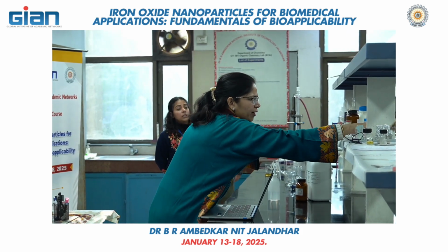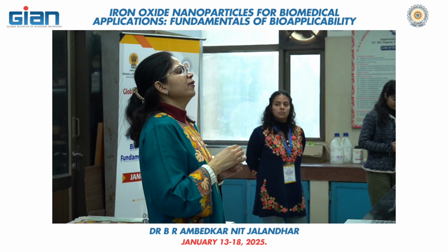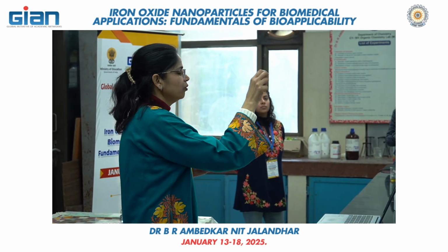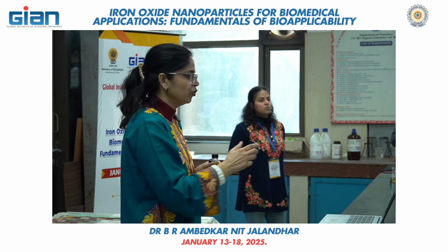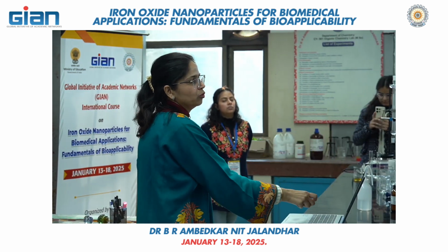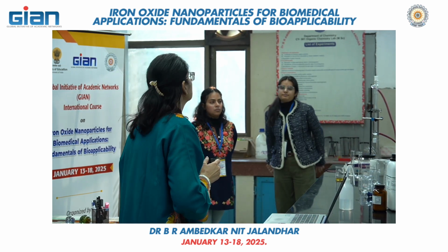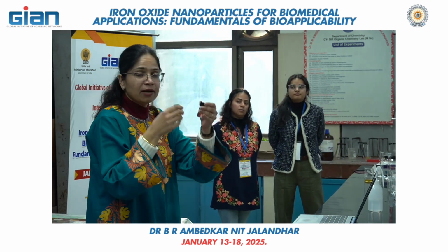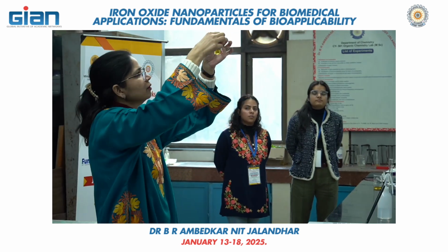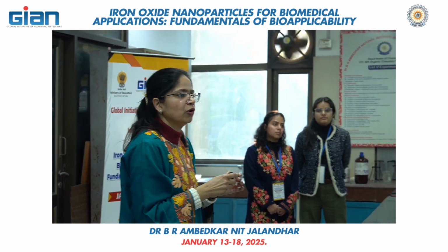So you can take the data from the UV spectrophotometer and using that data you can draw the Tauc plot. We have the original software, and through this software you can put the values and you can draw the Tauc plot, and further you can get the band gap. So these are the silver and your gold nanoparticles. So please preserve these in your almirah.